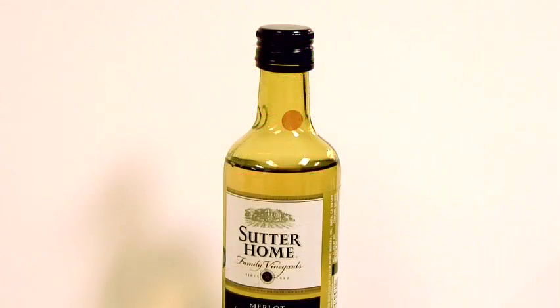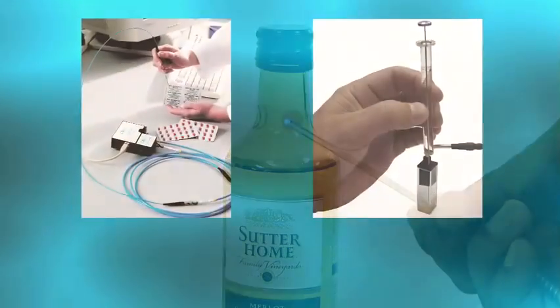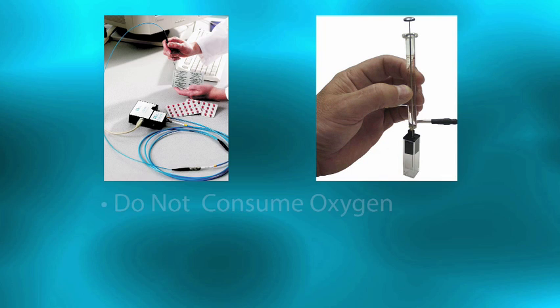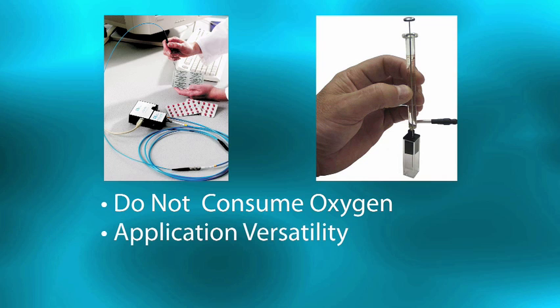Thanks to innovation in the development of our chemical sensing technologies, OceanOptics oxygen sensor systems provide viable alternatives to traditional chemical sensing devices such as electrodes.